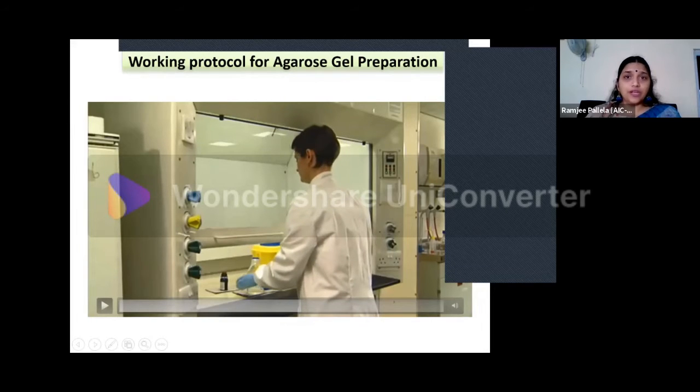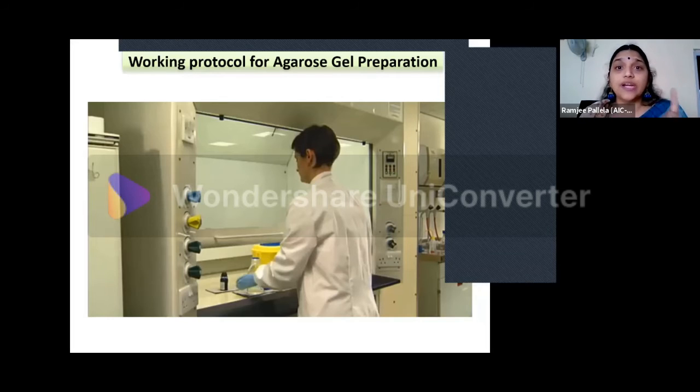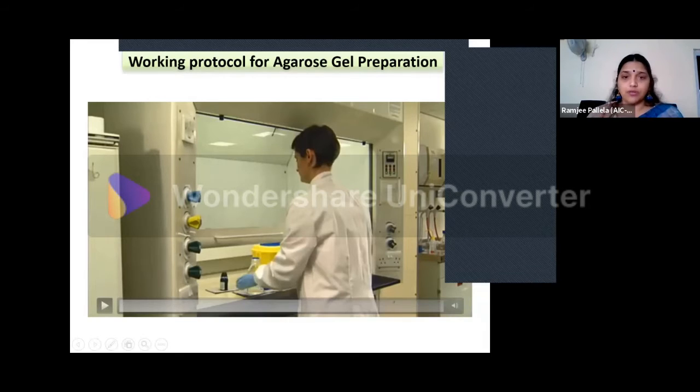So when you are handling EtBr, you should never handle EtBr with your bare hands. And not just that, once you have added it to the gel, you should never touch the gel with your bare hands either, because it contains that EtBr. Be very, very careful about it. It is a carcinogenic material. I told you it's an intercalating dye, so it can intercalate your own DNA in the cells. So you have to be very careful and not mishandle chemicals.